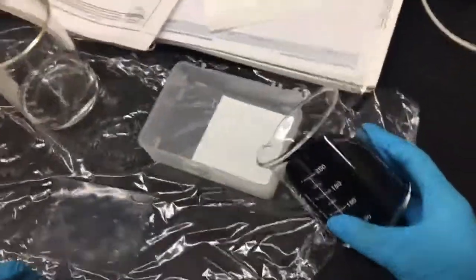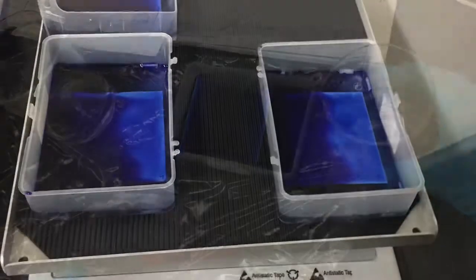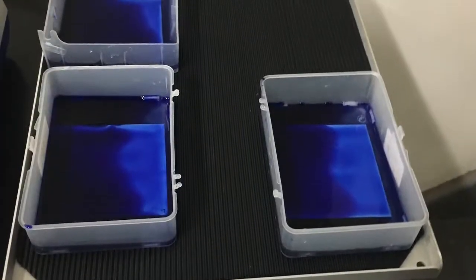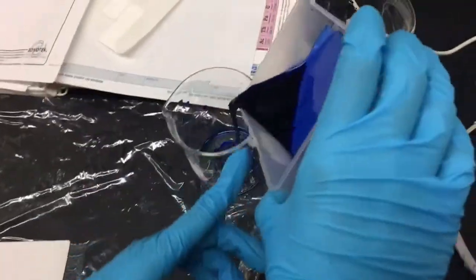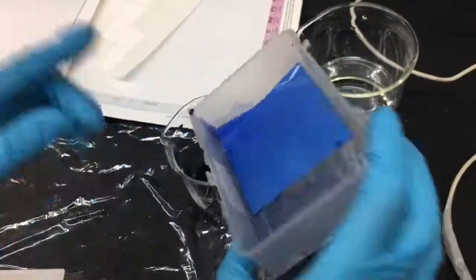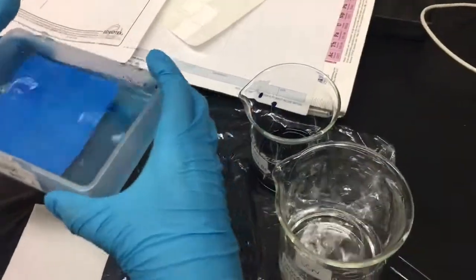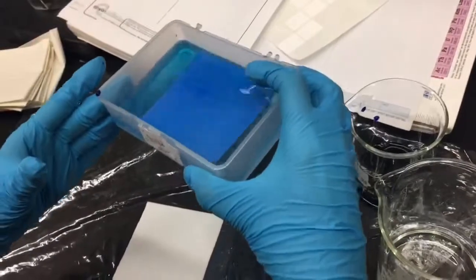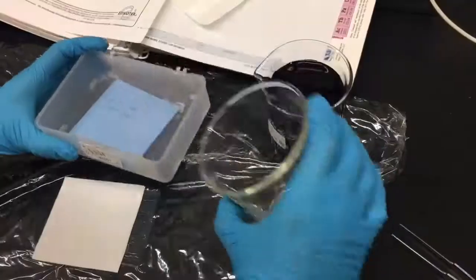So this is the Blue Blot solution, which is used for staining. We put the tray on the shaker for about 15 minutes, and then we discard the blotting solution and rinse the membrane with distilled water several times until the DNA bands are visible. As seen over here, the sheet is washed several times with distilled water.